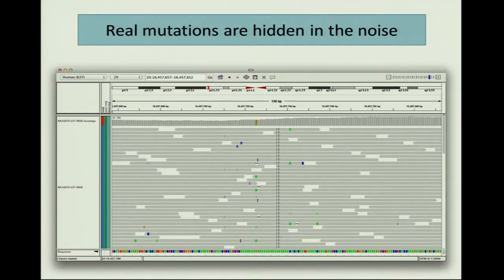The purpose of variant calling is mainly to discover, in a formal, systematic way, the genomic variants that are hidden in your data. Now, the problem in general is that it's not as simple as just looking over your reads and saying that there is a variant every time there's a mismatch with the reference. Why is this?